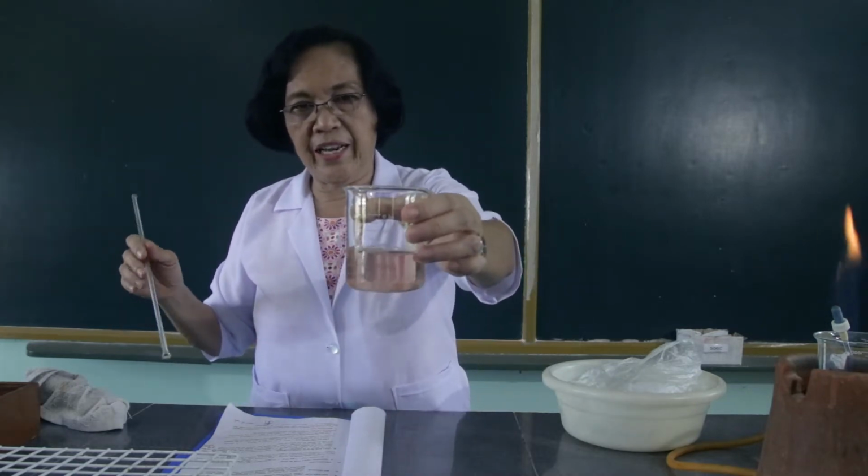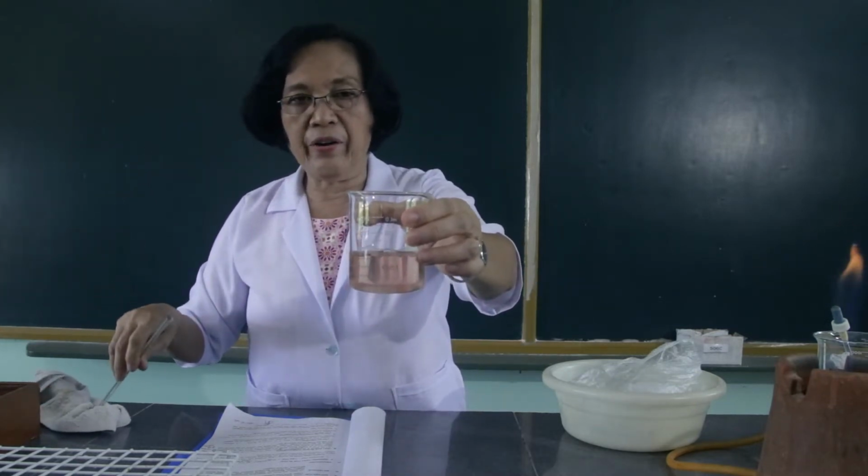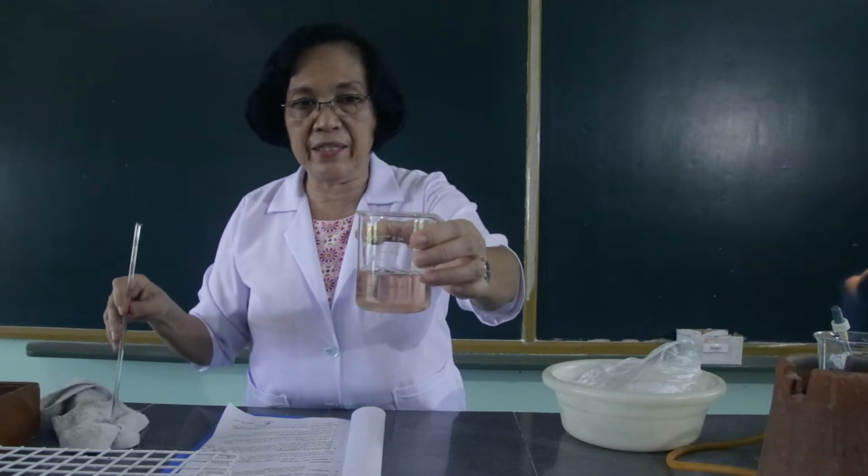So this is now the diluted blood, and we're going to get 2 ml from this diluted blood and put it into the test tube.